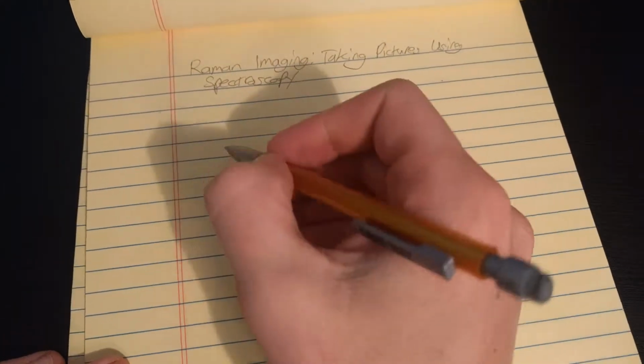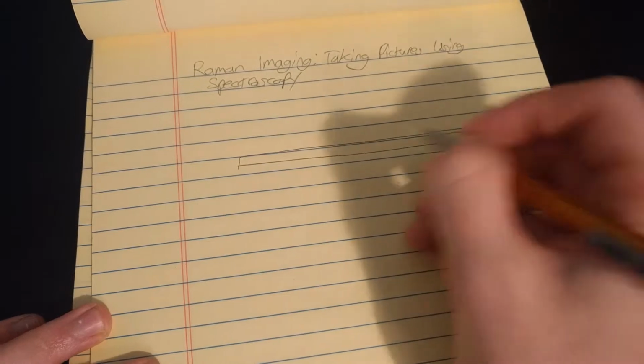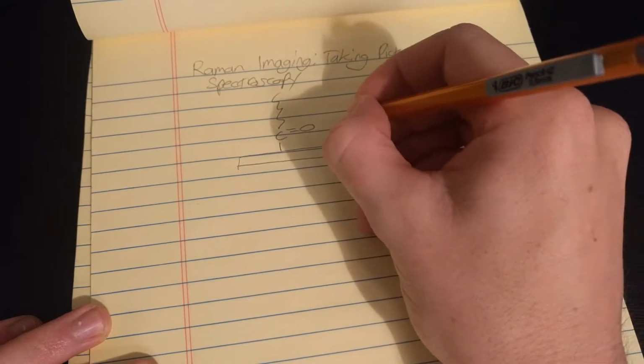First off, start by imagining a molecule with a carbonyl bond. A carbonyl bond is just a carbon double bonded to an oxygen. And imagine these three molecules adsorbed to a metal surface. So this is our metal surface, and we have some molecules containing carbonyl bonds. The rest of the molecule we're not going to care about.